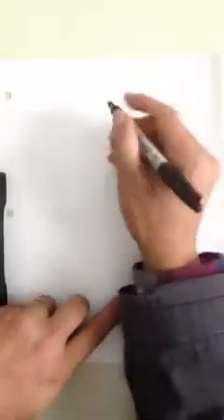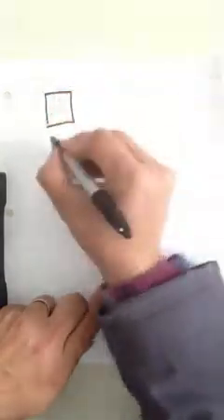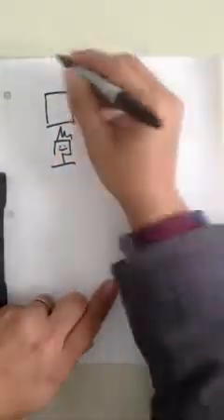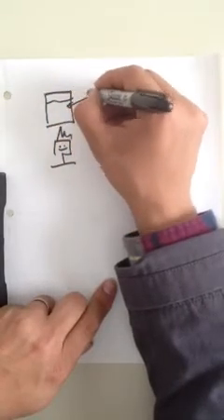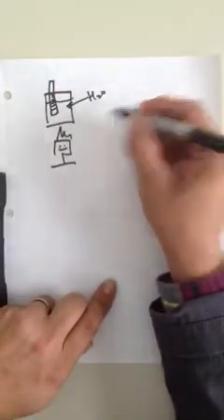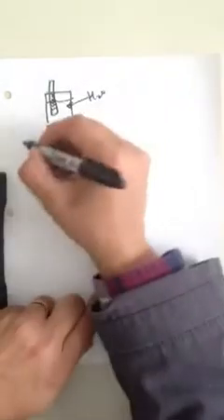All right, let's do some calorimetry. Let's think about what we did here. We set up a little marshmallow, put him on a little thing, let him burn, okay? In here, we collected H2O, we have a thermometer, right? And we have this guy burning, and the heat is going from here to here.